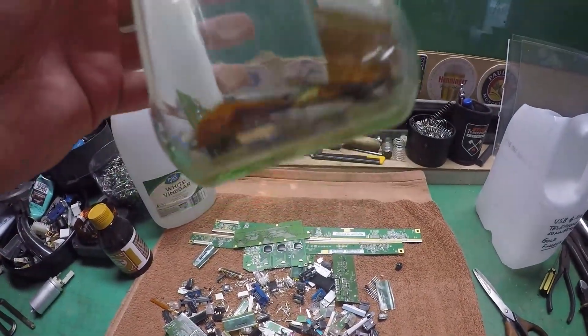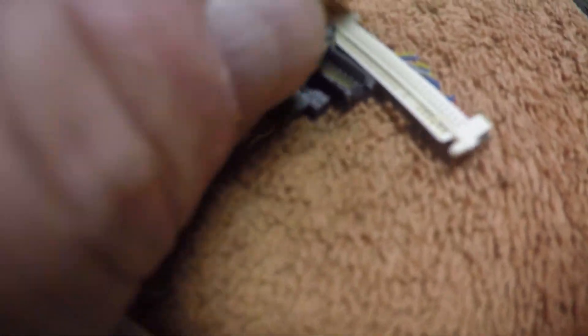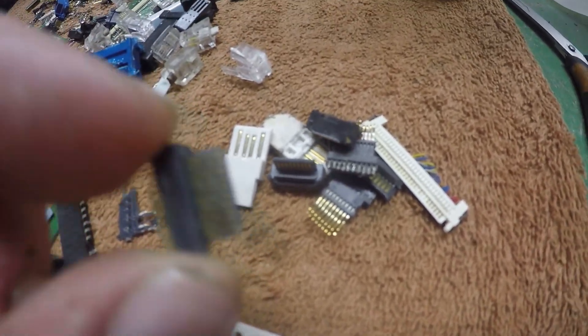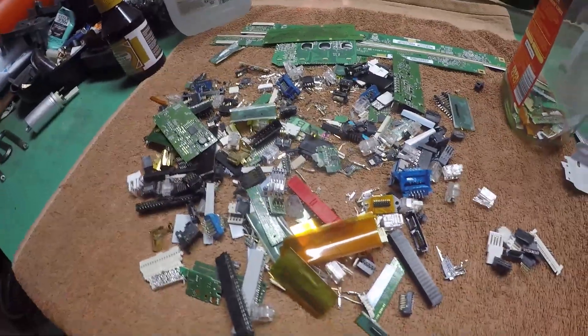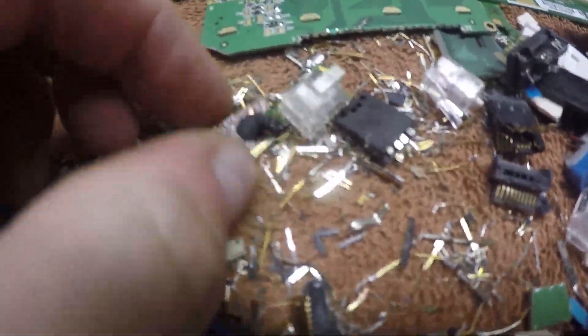Right, I've got enough for this experiment. I want to throw in some of these USB connections as well, just to see if it will remove the gold plate off there — I'm not so sure about this, but we can only try. I'll tidy all this mess back into my trusty container and may even throw in some pins.